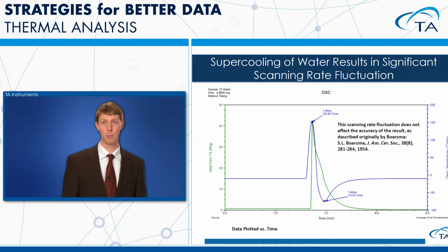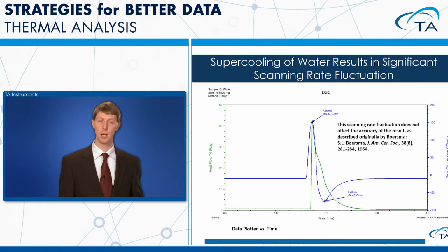Another data set where we're looking at the heating rate and the heating rate aberration that exists during that particular reaction. But you can see that it heats up fairly rapidly in that initial section, and the sample itself appears to cool down fairly significantly during that portion, but it's really mostly a function of it catching back up with the heating rate or the cooling rate of that particular DSC.